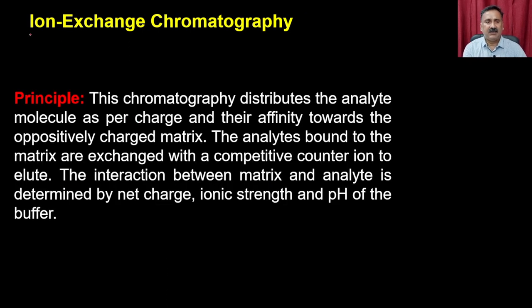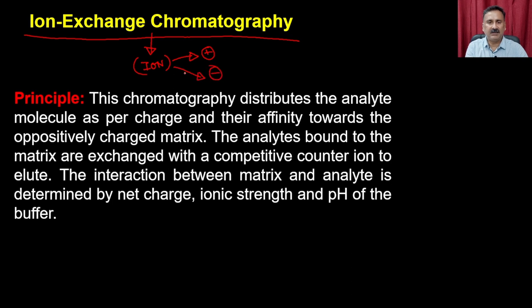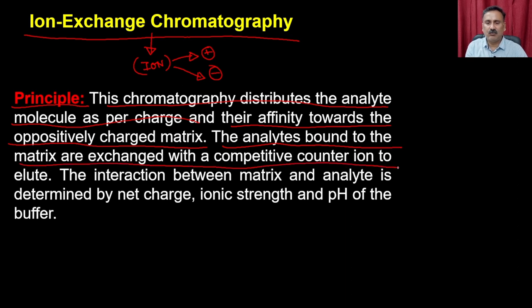As the name suggests, ion exchange chromatography is a chromatography where you are going to play on the different types of ions. Ions could be positively charged or negatively charged. So what is the principle of this technique? This chromatography distributes the analyte molecules as per their charge and their affinity towards the oppositely charged matrix. The analyte bound to the matrix is exchanged with a competitive counter ion to elute. The interaction between the matrix and the analyte is determined by the net charge, ionic strength, and the pH of the buffer.